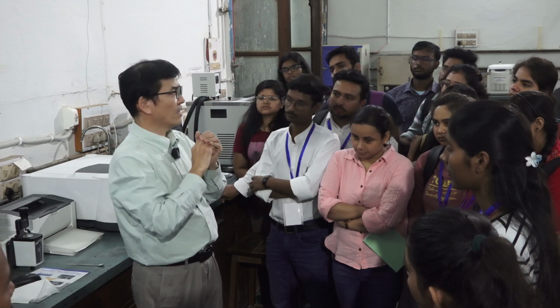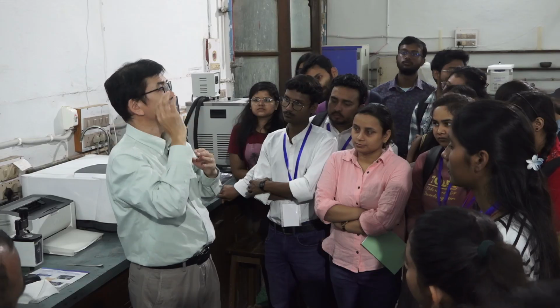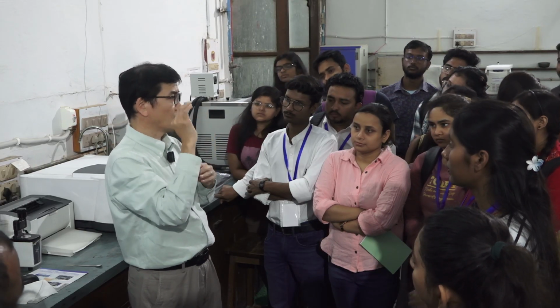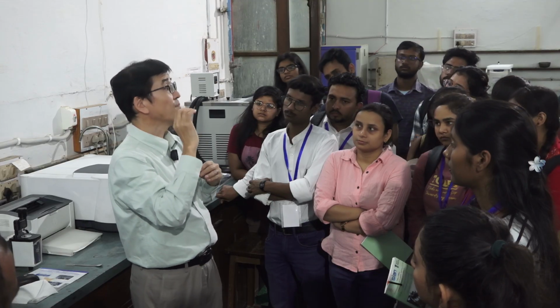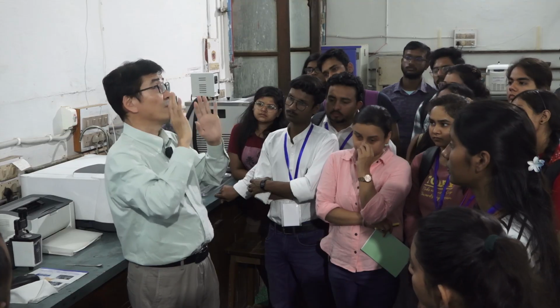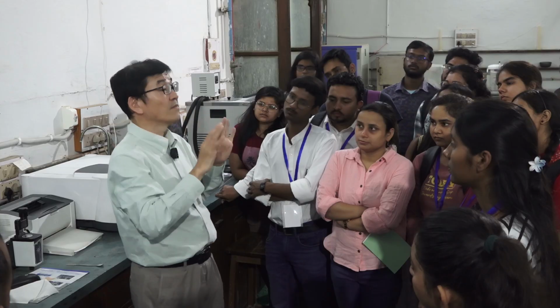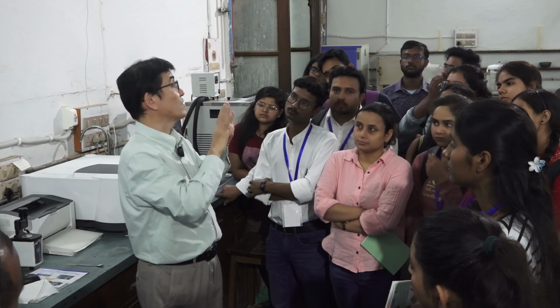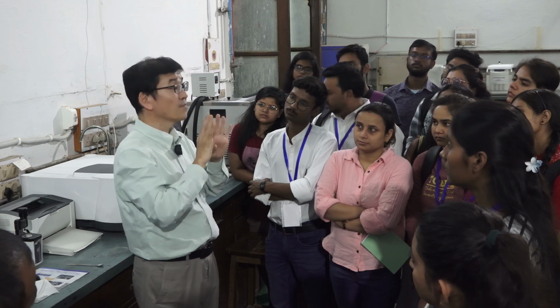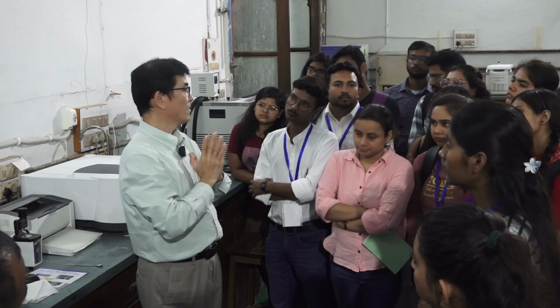Today I'm planning to measure sugar solutions, aqueous solutions of sugars: sucrose, glucose, fructose. In today's talk, I explained there is a clear difference among the spectral patterns of the sugars. So please identify what is the similarity, what is the difference, and please realize it's distinguishable. Is there any question?